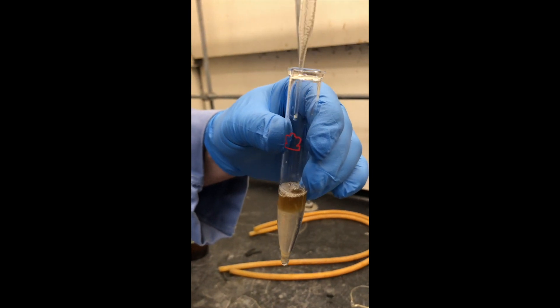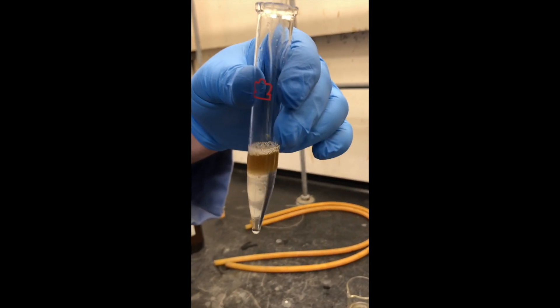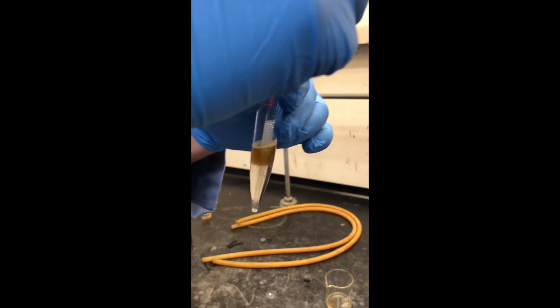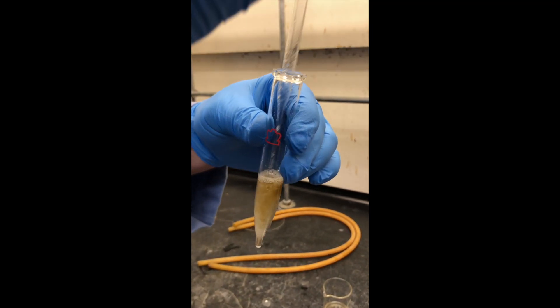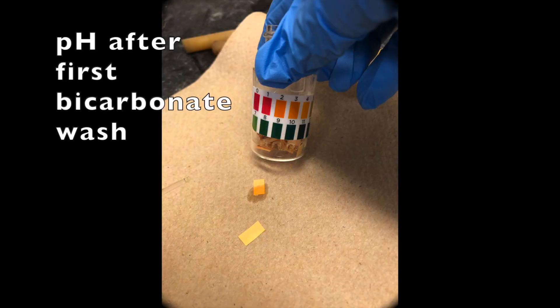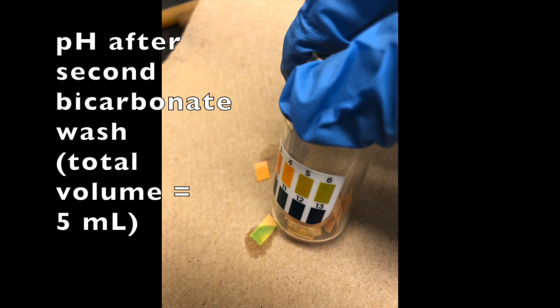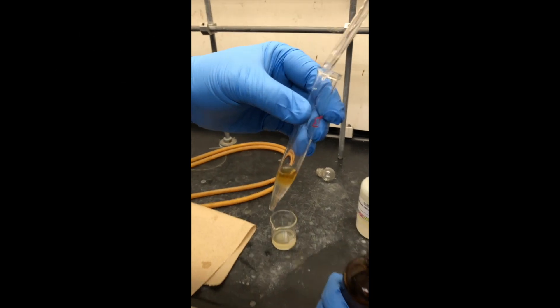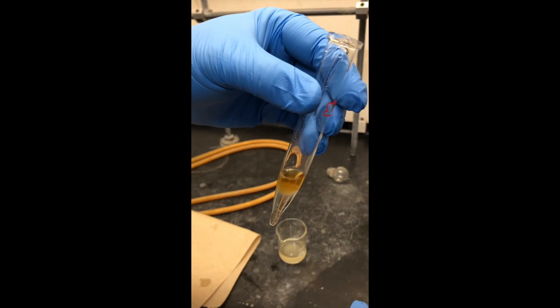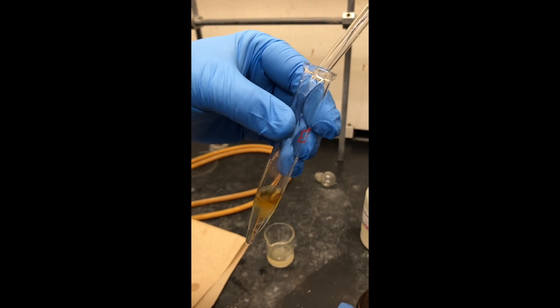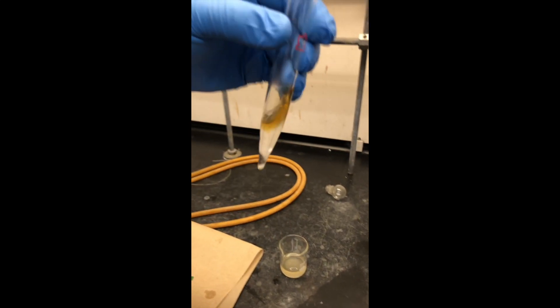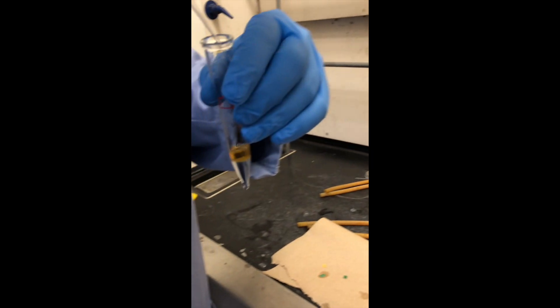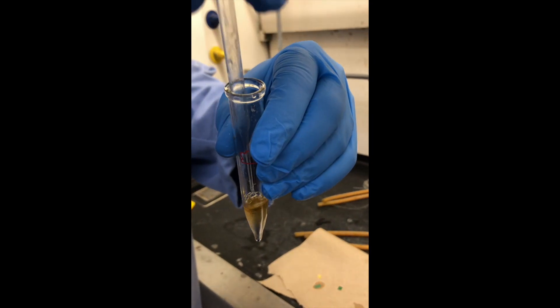We'll do that until it stops fizzing a little bit. So now we're adding two milliliters of four molar sodium chloride. And mix as before.